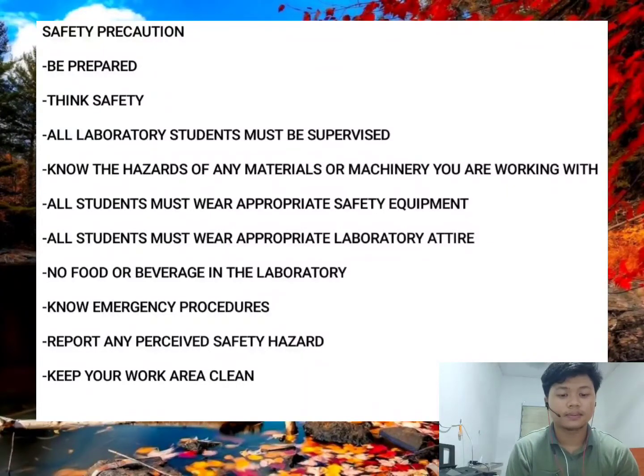The laboratory manual will review specific safety issues on individual experiments before you perform any test. Number 5. All students must wear appropriate safety equipment. Safety goggles must be worn anytime any laboratory experiment is being performed. In addition, safety equipment must be utilized based on specific experiment requirements.